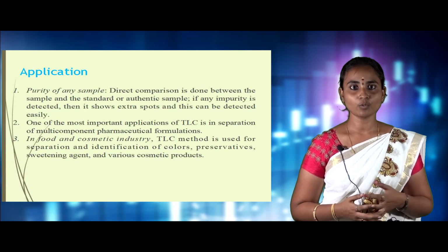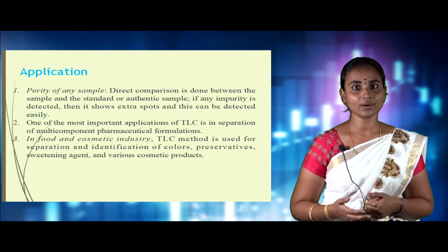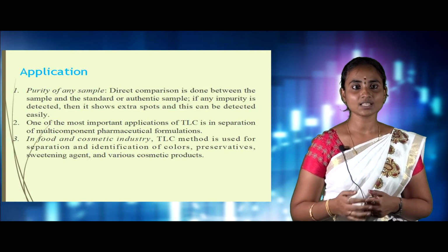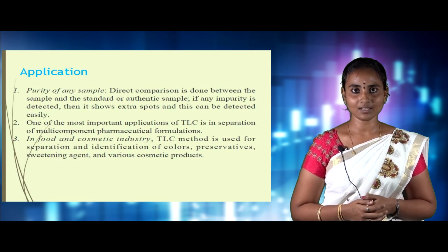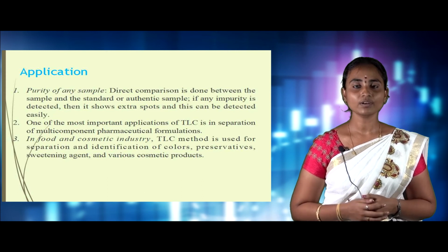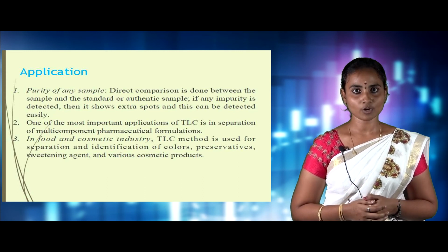The next one, one of the most important applications of TLC, is multi-component separation in pharmaceutical formulations. And the third one is that it is highly used in the food and cosmetic industries. TLC is highly used for separation and identification of colors, sweetening agents, various preservatives, and also various cosmetic products.